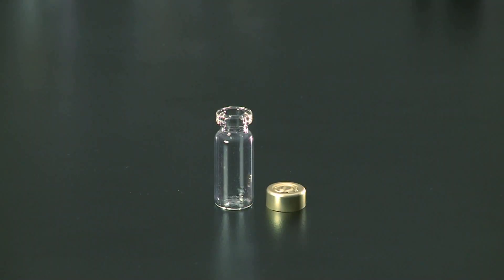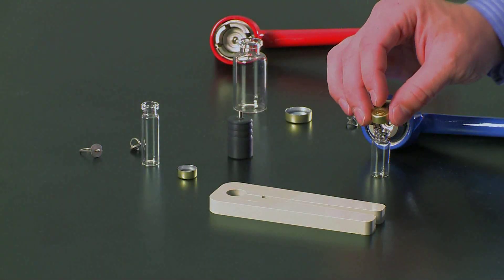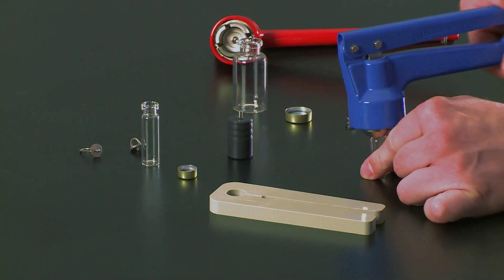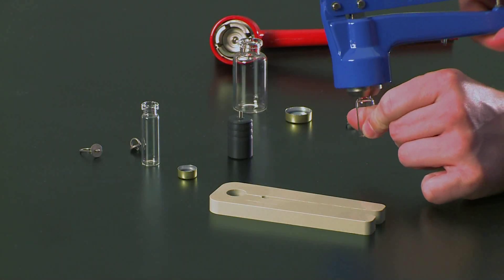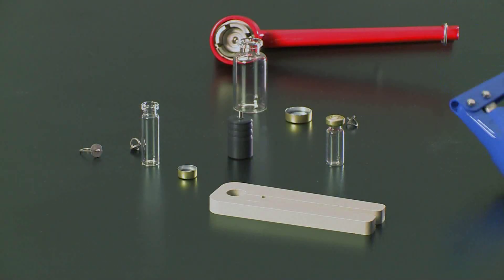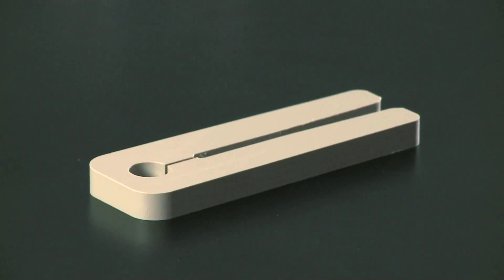We have a 3 milliliter ampule where we would prepare and load with your sample. Once your sample is loaded, place the cap, then rotate and seal with the crimper. Make sure that you hit the stop. Once the ampule is crimped, you have to use the adjustment tool.